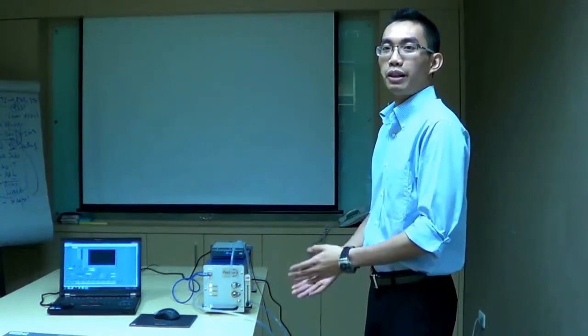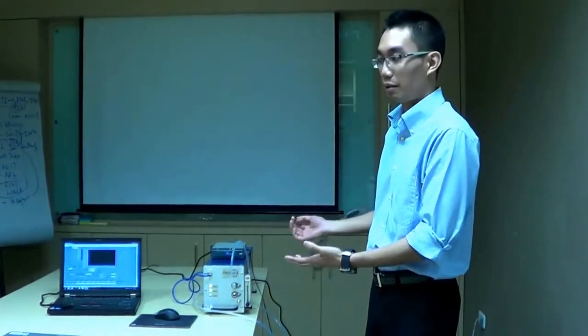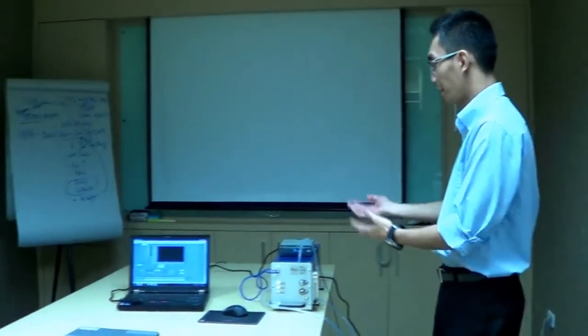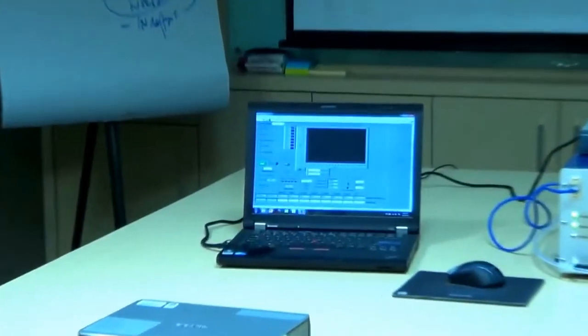Hi everyone, today we're going to do a simple demonstration of our Precisive demo system unit. Before we start, we'll explain the different components of this system. We're going to start with the laptop. We're going to use this laptop as the HMI, which is the human machine interface.